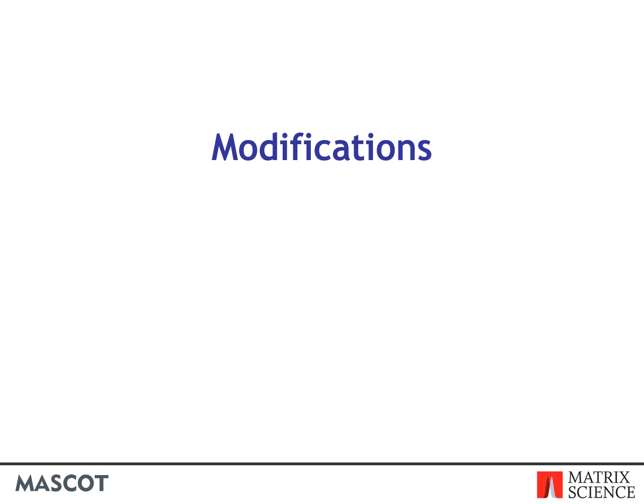Modifications are an important aspect of database searching. This talk describes how we handle both natural, post-translational modifications and also chemical modifications, which may be deliberate derivatization or accidental artifacts of sample handling.